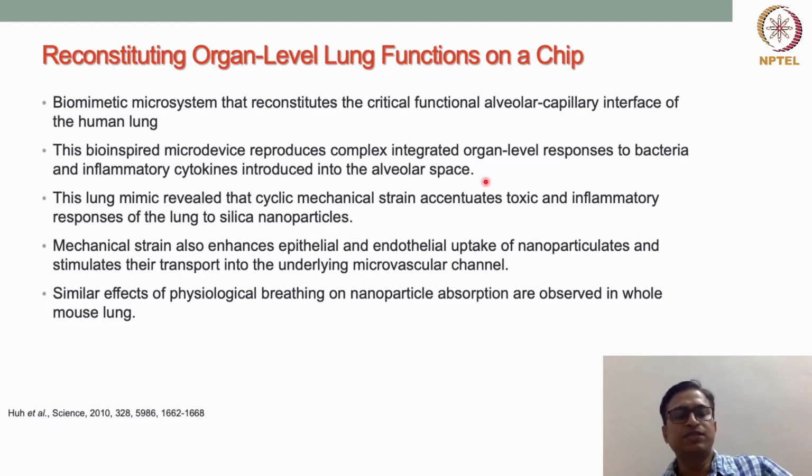And this device also mimics the inflammatory cytokine responses. This device has an alveolar space and also another vascular space, right? Both these things are present, and in between there is a fine membrane-like structure.